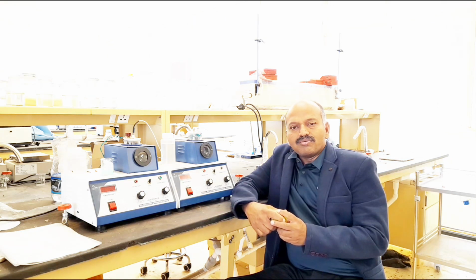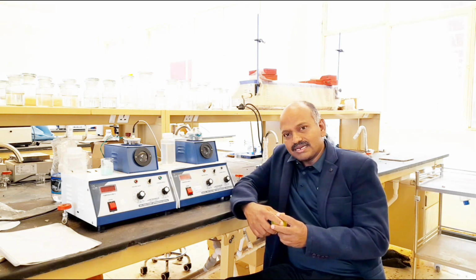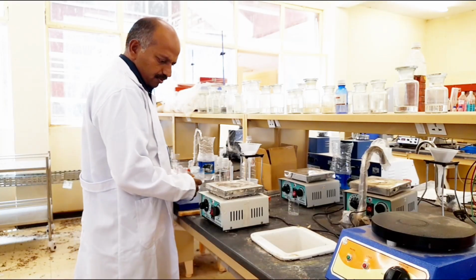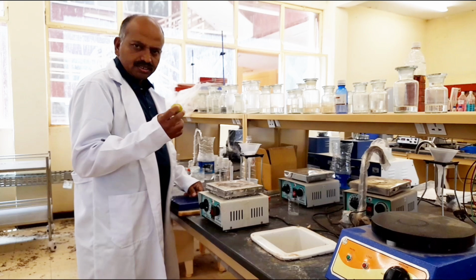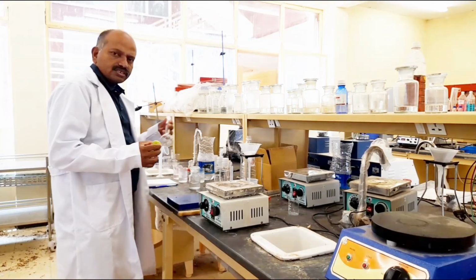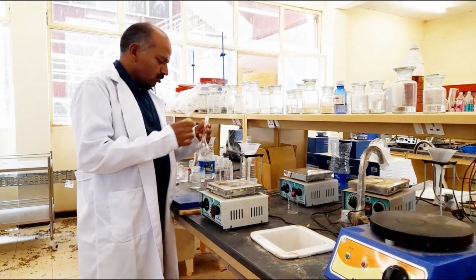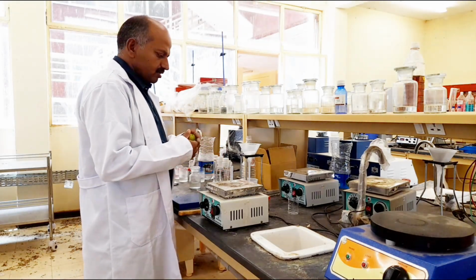This is how we have to perform the experiment. This is the demonstration. Now let us do the experiment visually, practically. This is the workbench for performing the experimentation. We have to cut the lime into 2 pieces and squeeze the juice into the volumetric flask. This is the volumetric flask. This is another volumetric flask. Now we have to make this juice.